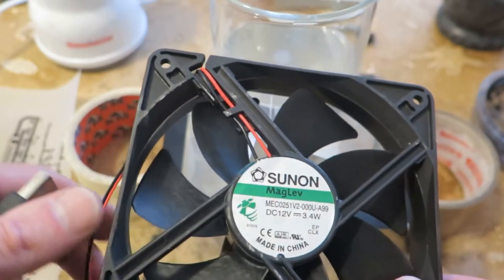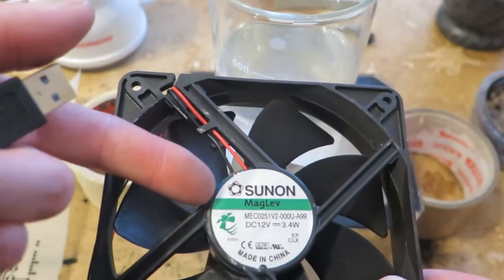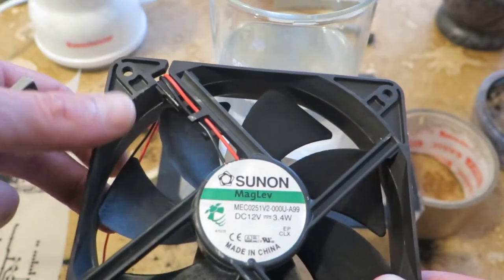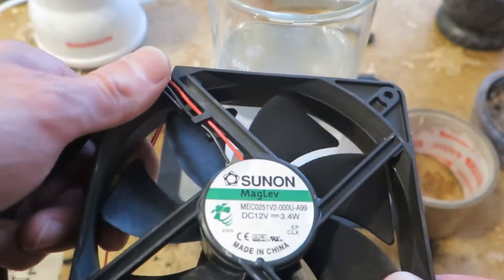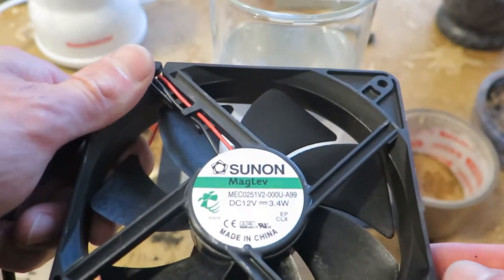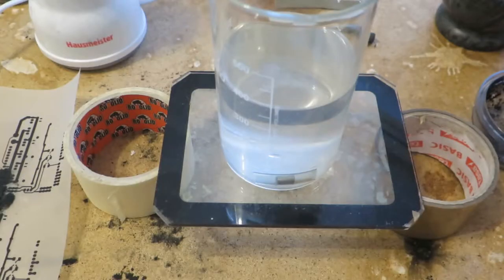You can hook up to a Hall sensor and drive this with Arduino or whatever, and you can detect going out of sync. Basically you will have too high RPMs, so you can detect that and stop it.